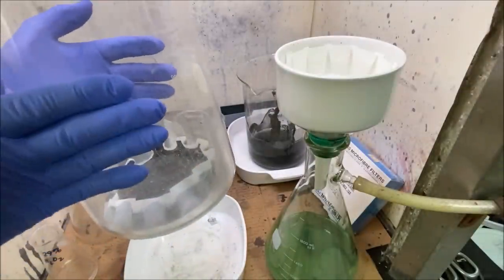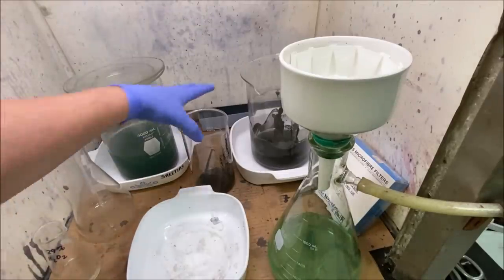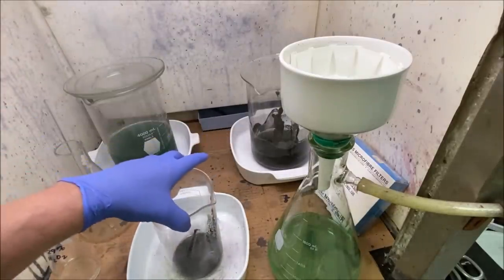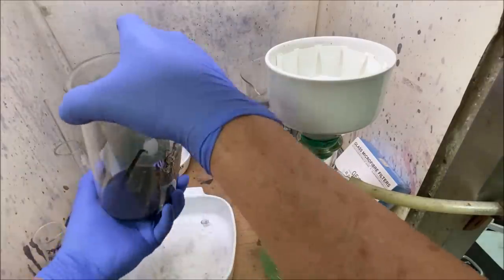This is ready to be processed with Aqua Regia. And now we'll just continue with our filtering, trying to gather our solids up into this funnel.